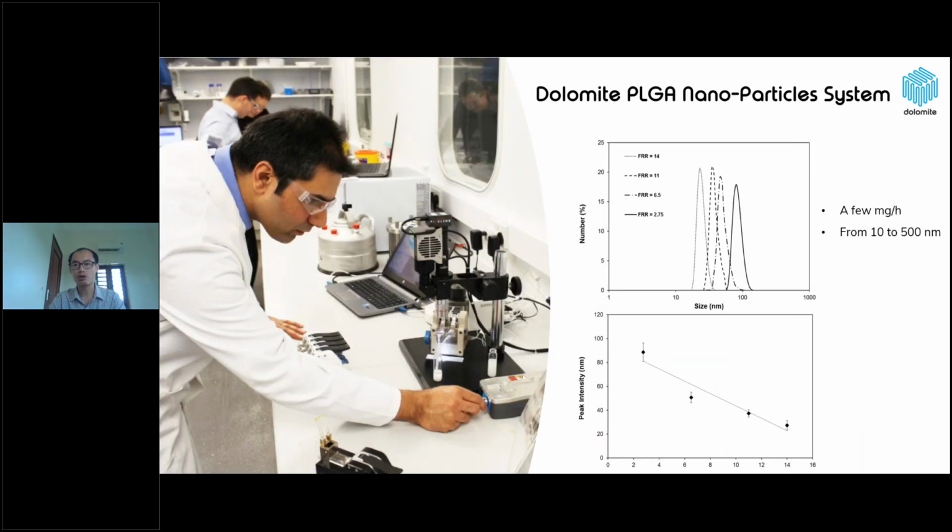So here showing some results for the PLGA nanoparticles. We can make a few milligrams per hour with the size ranging from 10 to 500 nanometers by changing the flow rate ratio. In this graph you can see when we decrease the flow rate ratio, we can increase the particle size.